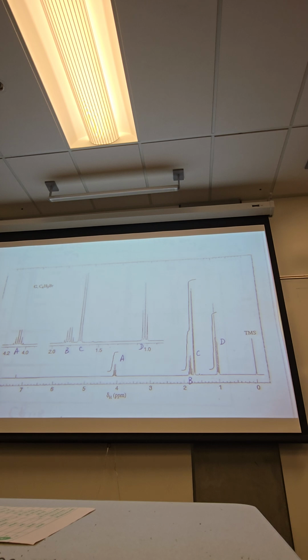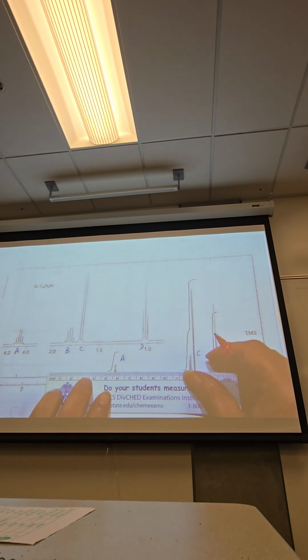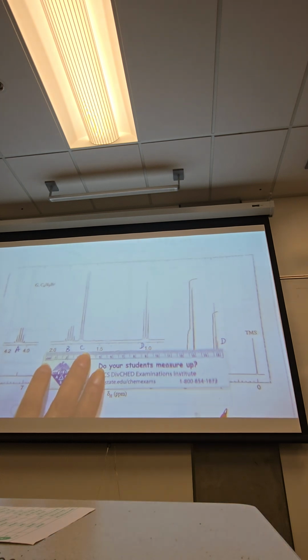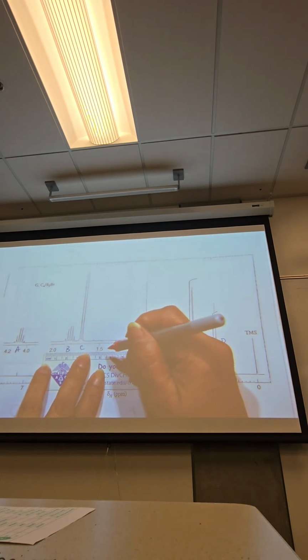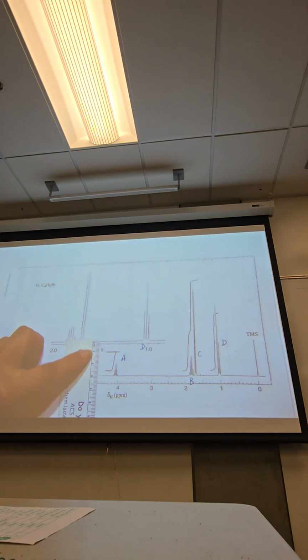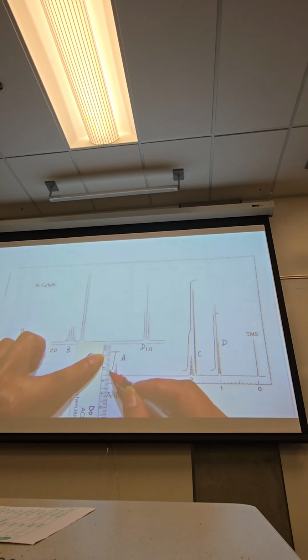So what we need to do is use a ruler and measure the distance between the start of the curve and the end of the curve. Again, the units don't really matter as long as it's a ratio.